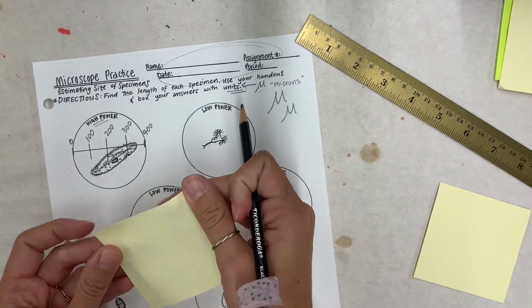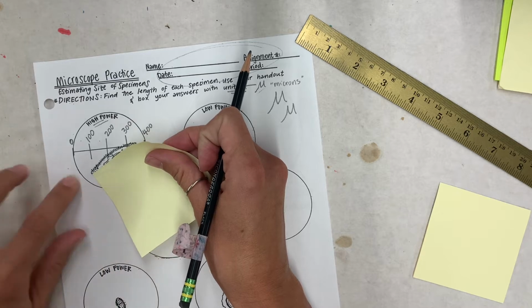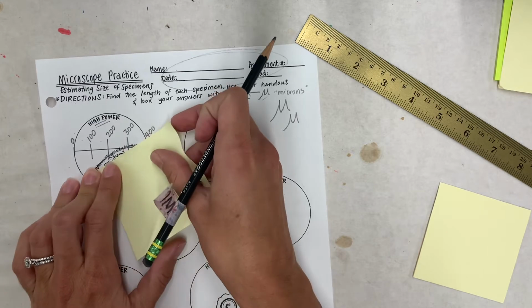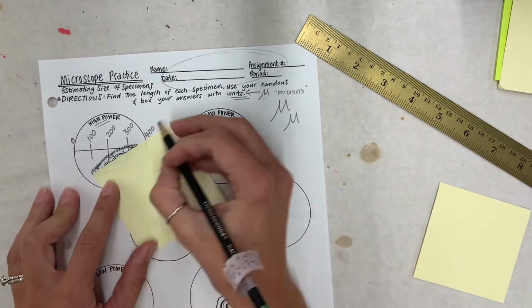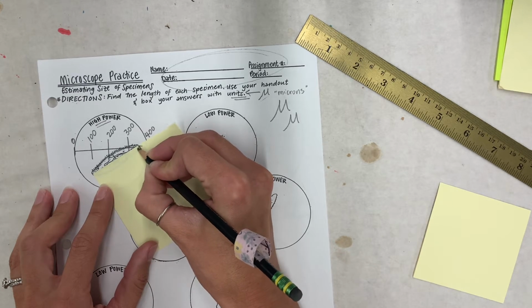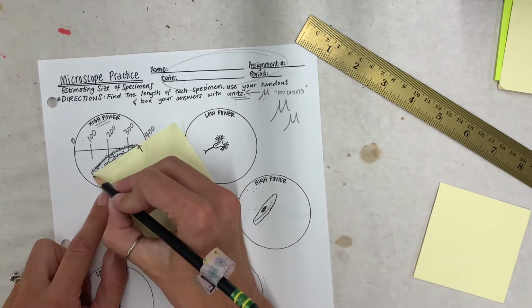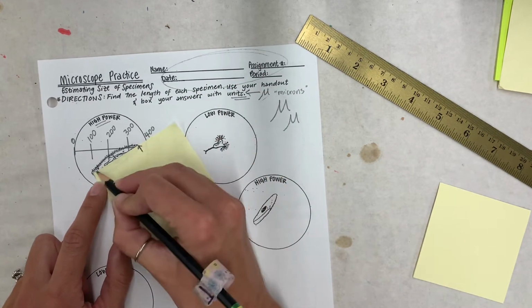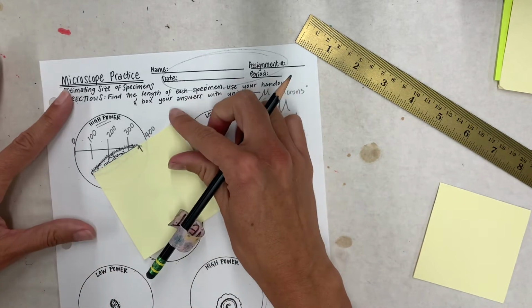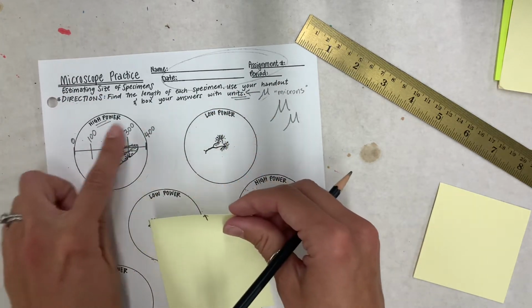So you're going to take your Post-it note and lay it down on one end of the specimen, right? The edge of the Post-it note lines up with one edge. And you're going to lay it flat onto your specimen and arrange it from one end to the other end. And you're going to use your pencil to draw a little arrow or tick mark where your specimen ends, right? We're using this end of our Post-it note, and then we're going to draw a little mark to show where it ends. Once we have that mark indicated, we're going to peel up our Post-it note, and then we're going to line it up with the ruler that we have drawn here.